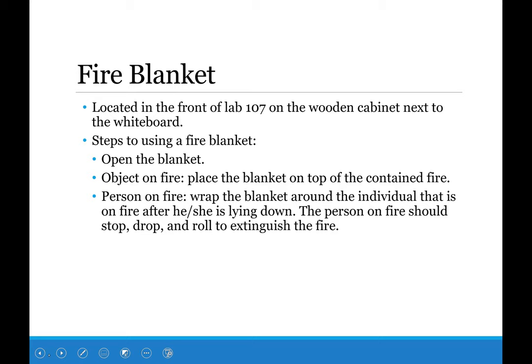A fire blanket is what we put on humans whenever they catch on fire. We have a fire blanket at the front of classroom 107 only. To open it, pull it down — be prepared for fiberglass when you open it. For an object on fire, place the blanket on top to cut off oxygen. For a person on fire, it is very important they are lying down first before you wrap the blanket around them; if they're standing, the fire will go upward onto their face and hair, which can be fatal. Have them stop, drop, place the blanket on top, and roll.